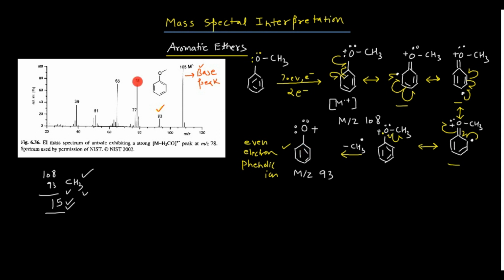Right, I am going to explain this 78 fragment now. How actually am I forming this 78 fragment? So for this I need a little space. So what I can do, I can remove this one. Okay. So for this, again I will draw this thing.